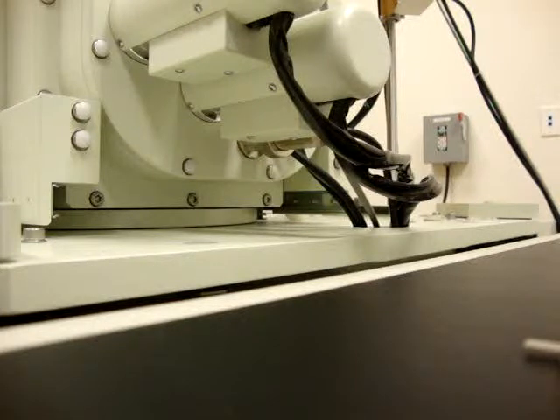Let's go back to the tree. Full image, right click it. Standard. This gives you more control. Specimen. Right now it's under observation, and there's comparison.